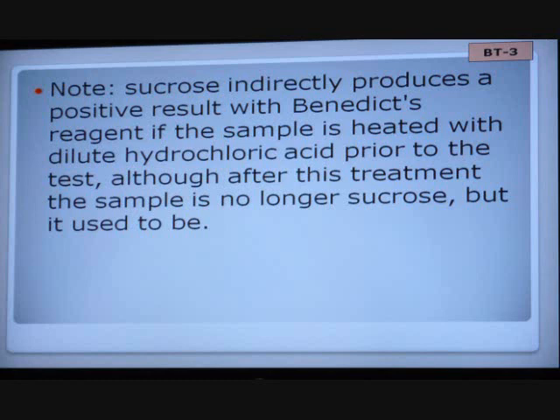So if you tested, for example, if you had a solution in here and you swear you put sugar into it, but it stayed blue and didn't turn colors, you could verify that it is in fact a sugar by going right back to your solution, adding some weak acid to it, and you boil it. And then you drop in your Benedict solution, you put it in a hot bath, it will change colors then. But the sucrose you had is gone. You're seeing a byproduct of the glucose you had when it reacted with the hydrochloric acid.